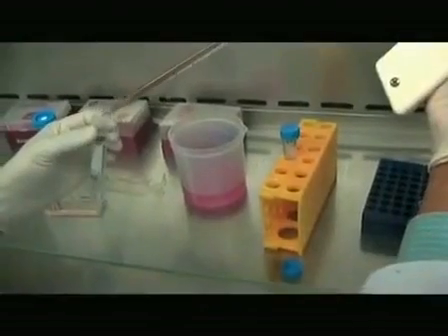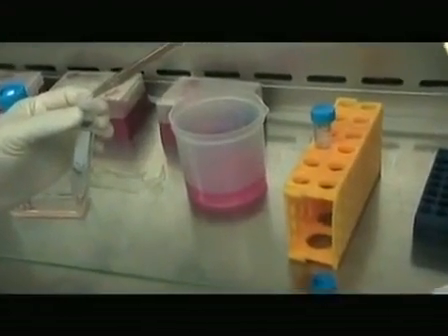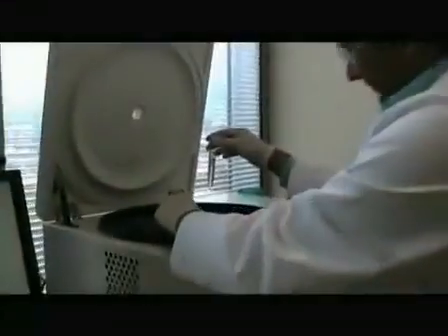We begin by placing aliquots of the cell suspension into 15 ml Falcon tubes. Cells are washed twice with PBS by centrifugation at 150 g and resuspended in fresh media.